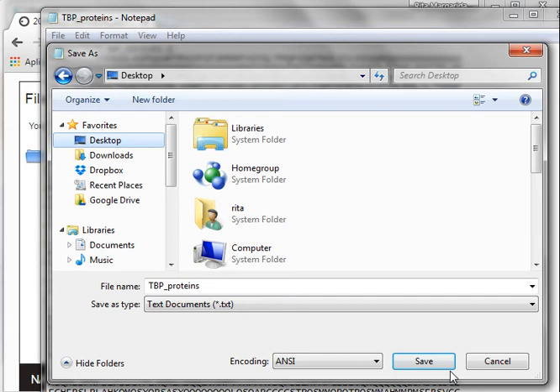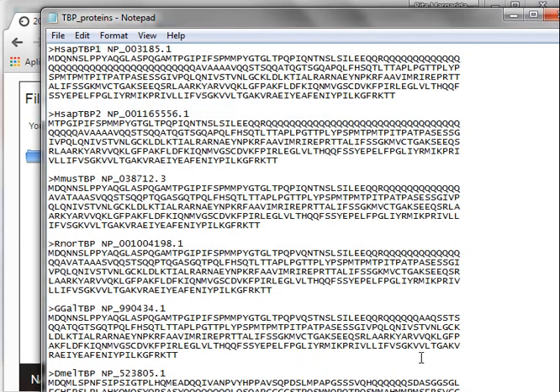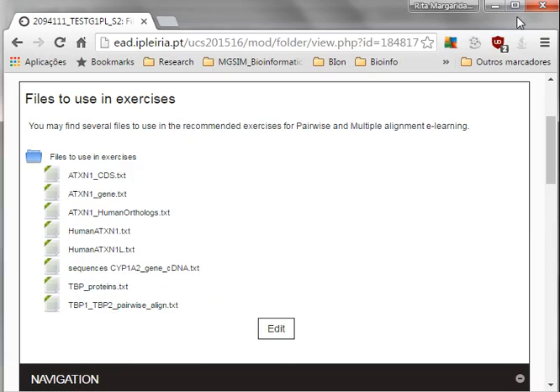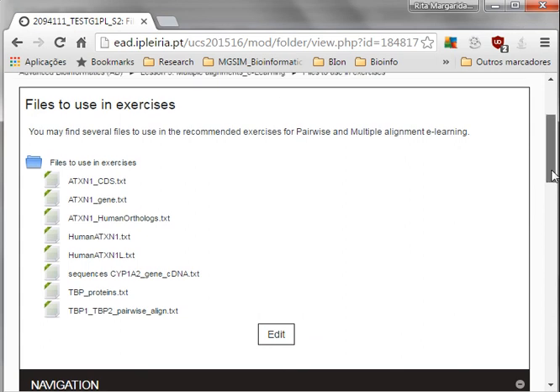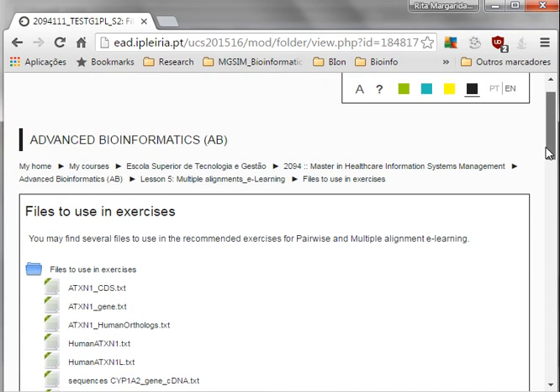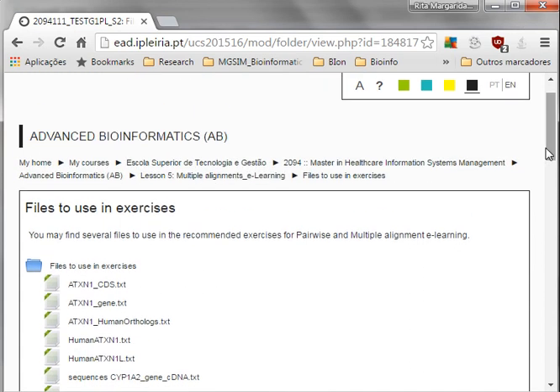Most of the times it's called the name of the protein in plural because you will have to save several proteins or several genes. Most of the times several genes are too big to perform with these softwares that you will use for multiple alignment. But most of the times you compare transcripts. Now that you have your sequences, you can go and perform your multiple alignment.